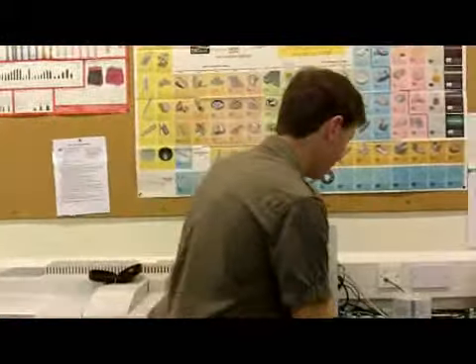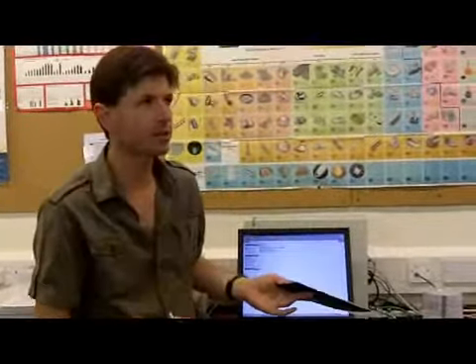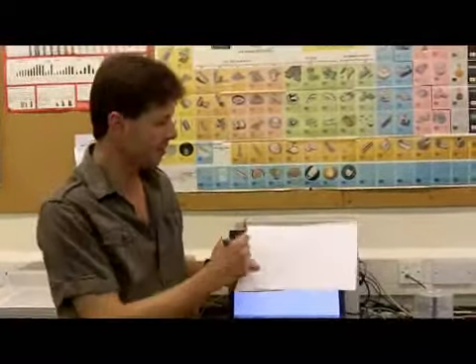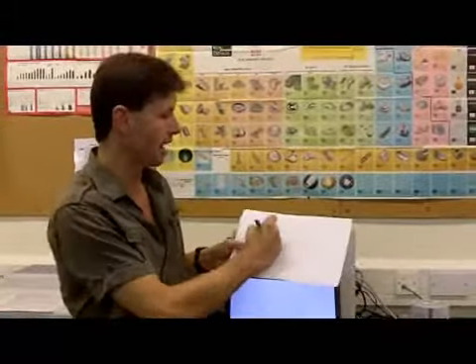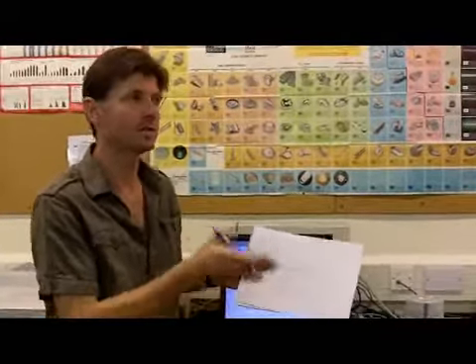I should tell you as well that what happens during the experiment is we start off with a clean surface and we expose it to progressive amounts of phenyl iodide. And the units we use are Langmuirs, so you will see that a particular spectrum was run at 30 Langmuirs. And then one that was run at 100 Langmuirs has had another 70 Langmuirs added on top.